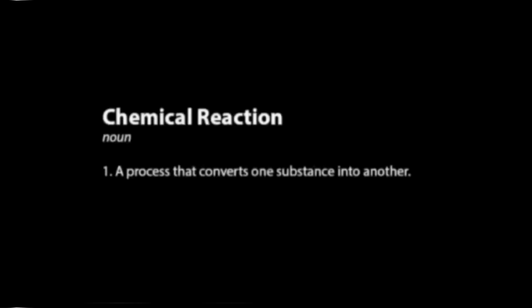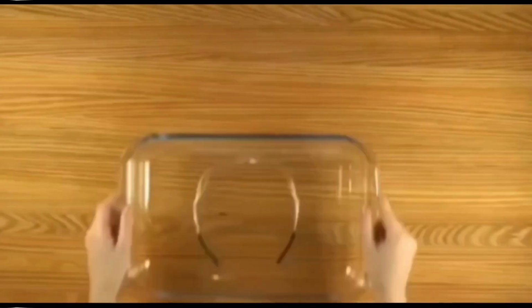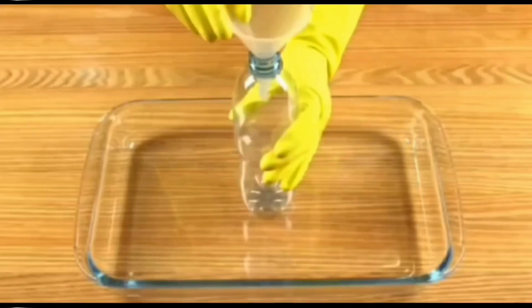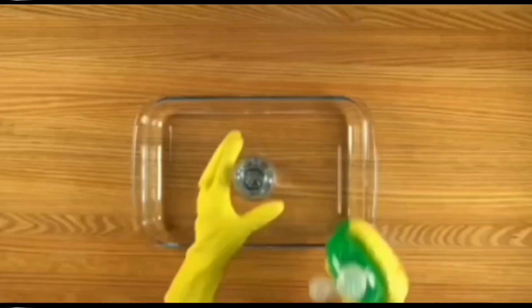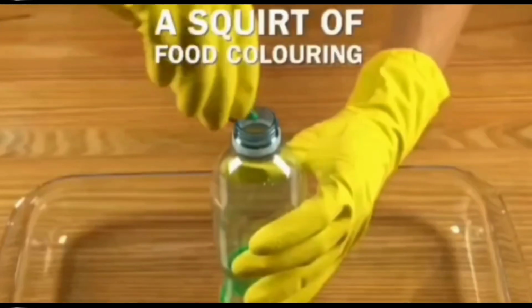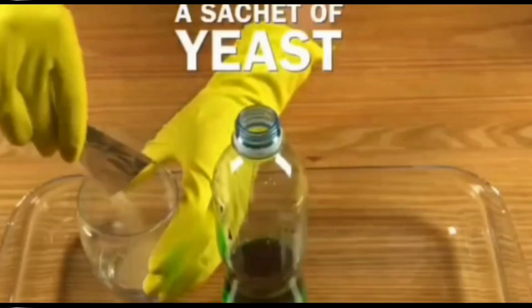Elephant toothpaste experiment is a reaction where hydrogen peroxide rapidly decomposes into water and oxygen gas. The oxygen gas gets trapped in soap, producing a large amount of foam, like we see in this video. So, in this video, we will use hydrogen peroxide, liquid dish soap to trap oxygen as bubbles, food coloring for visual effect, and yeast as catalyst.